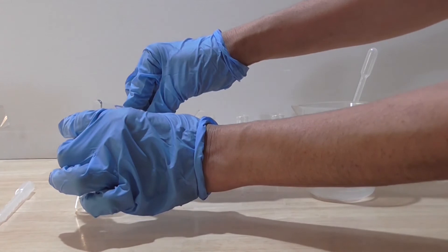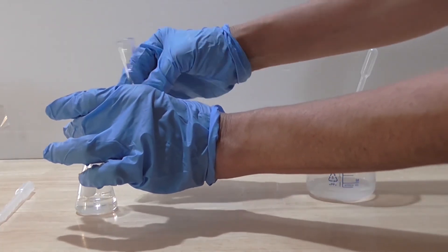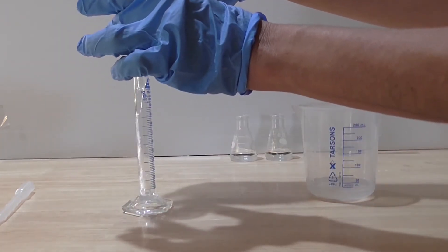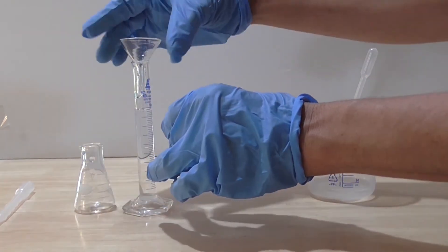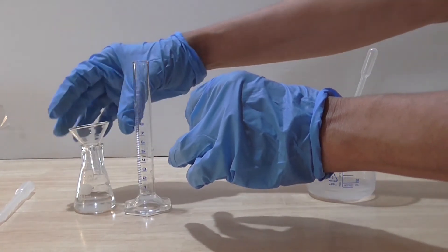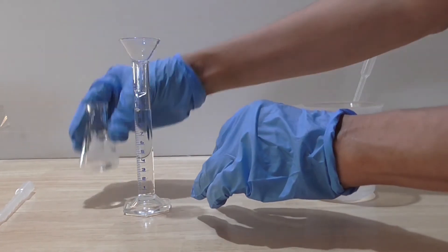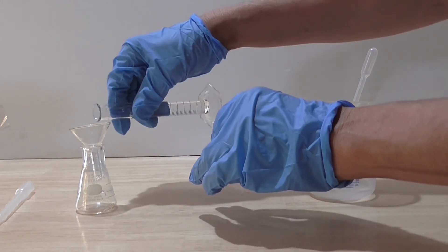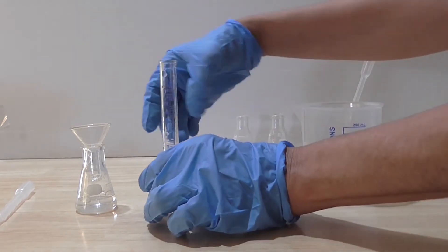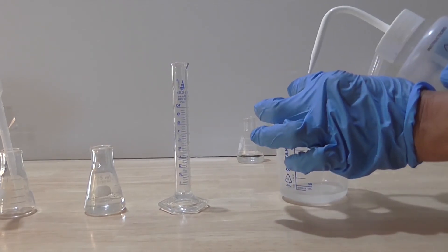Ensure the newly prepared acid is well mixed. I now have hydrochloric acid that is 0.001 molar. I am now ready to prepare my next concentration of acid.